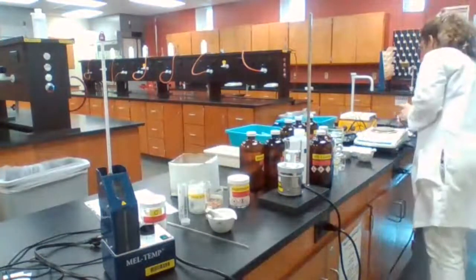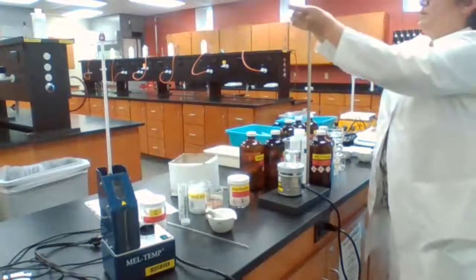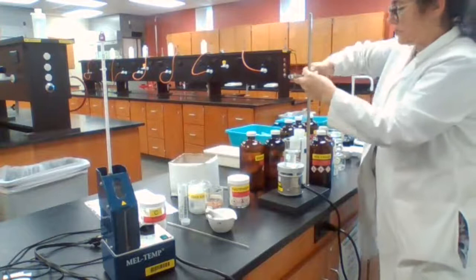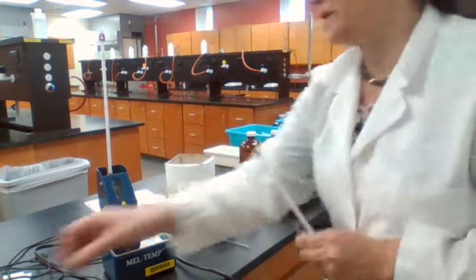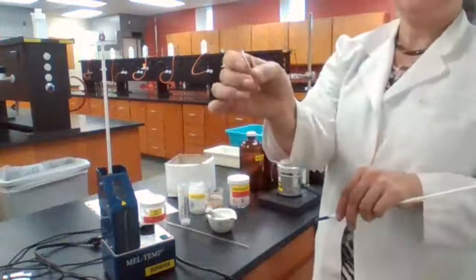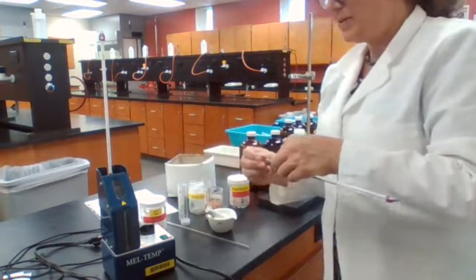So, for boiling point, we are using boiling point. We're just using unknown for the boiling point. And to prepare for boiling point, I'm using a sealed tube, or a small test tube, attached to the thermometer using a rubber band here.